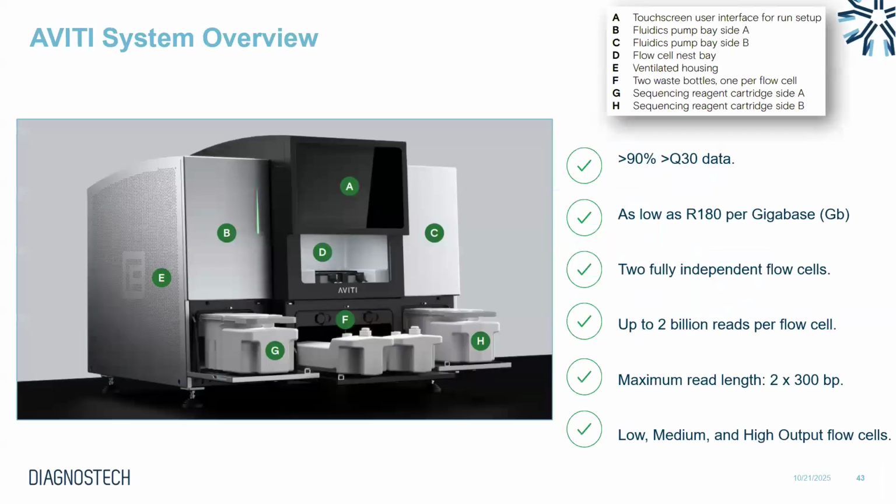All right, so over here you can see the system. It's actually a dual-sided system. It has 2 sides, so you can load 2 flow cells and 2 reagent cartridges. And these 2 sides can be run concurrently, or they can be run completely independently. So this just demonstrates the flexibility of the system. Essentially, you can see it as 2 sequencers that are connected.